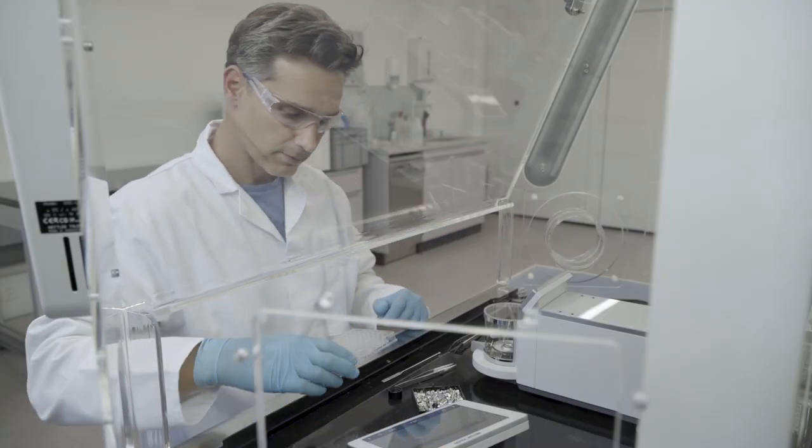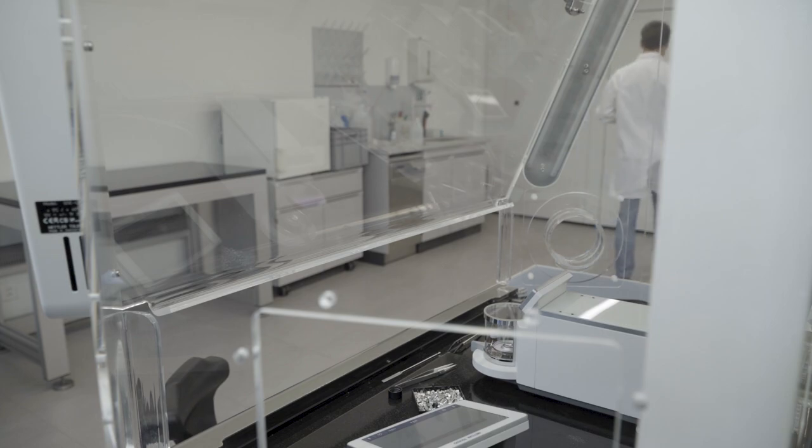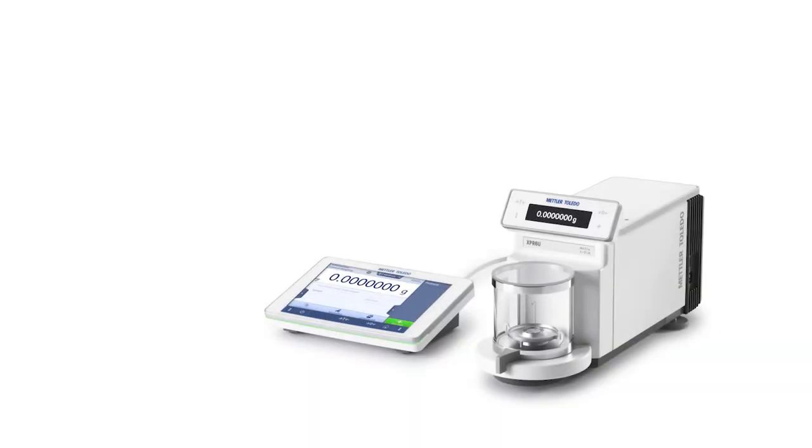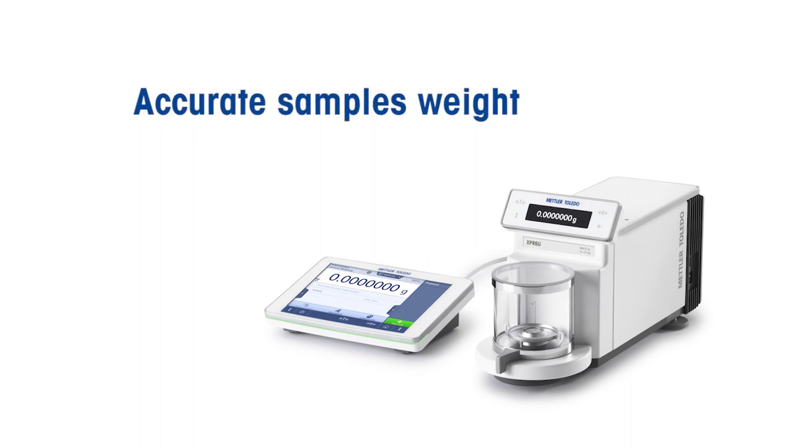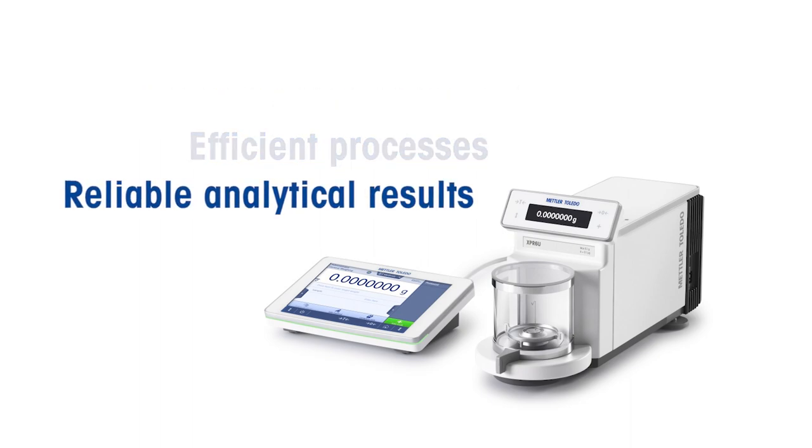The samples can then be transferred to the elemental analyzer. Preparing samples for elemental analysis using an excellence level microbalance ensures accurate samples, efficient processes and reliable analytical results.